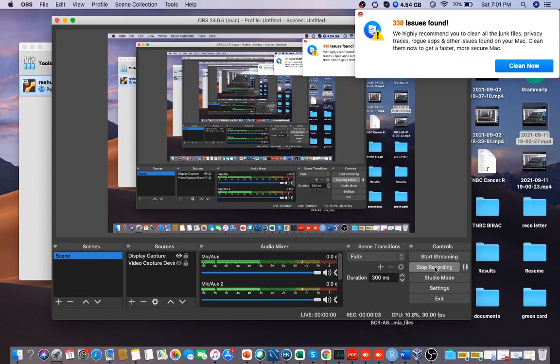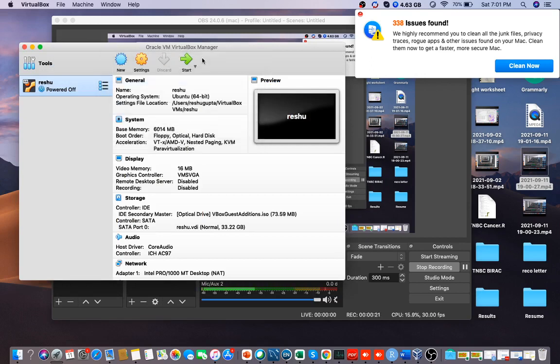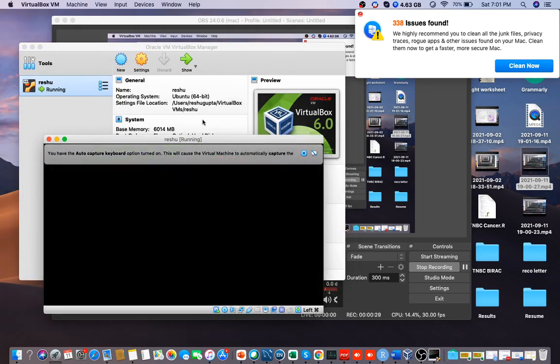Okay, so today we will learn about some basic commands of the Linux platform. For that, since mine is an Apple laptop, I have downloaded VirtualBox, and in this you can simply download the operating system, which is Ubuntu, that you can see here.